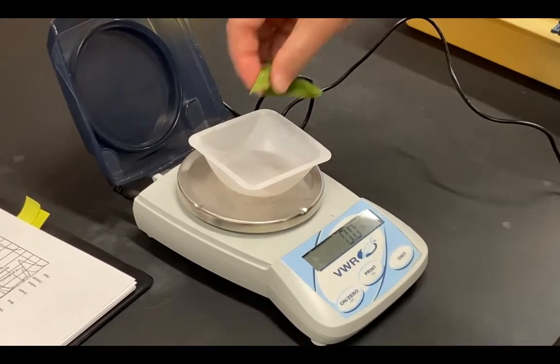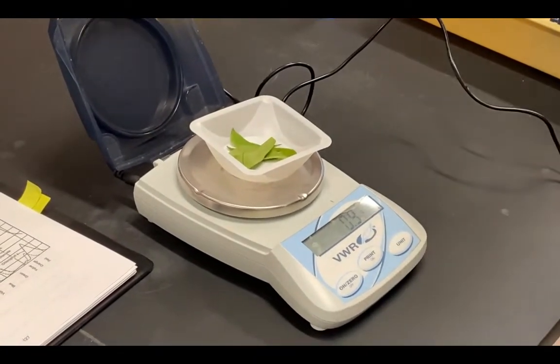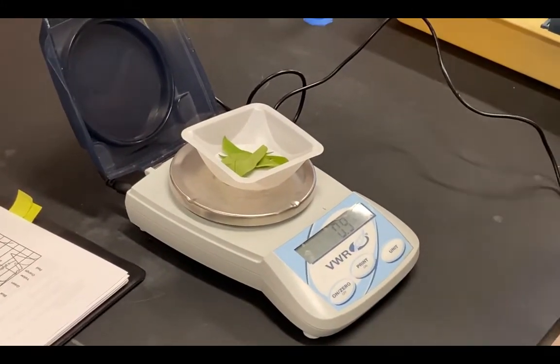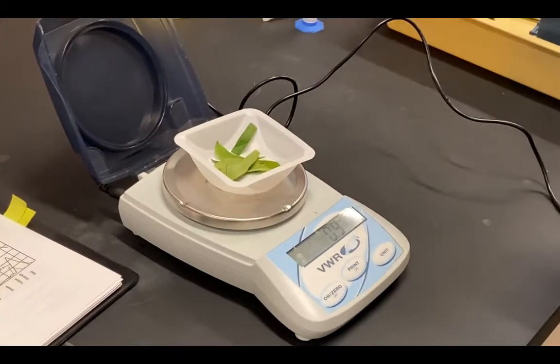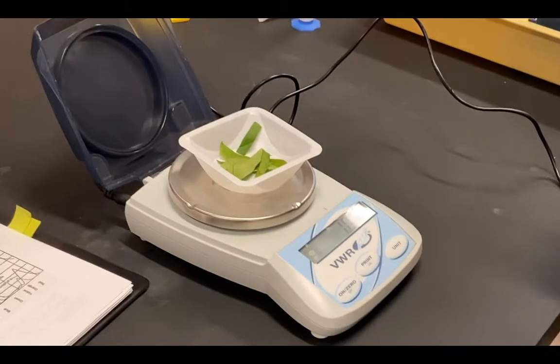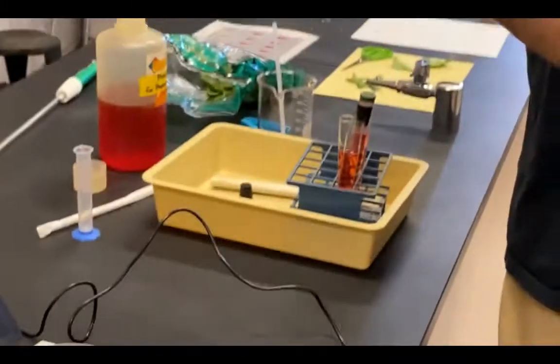I'll bring some cut spinach over. Make sure that I've got 1 gram. Looks like I'm a little bit short. Okay. Looks like I'm within my 1 gram. I'm going to go ahead and add that to tube number 1.